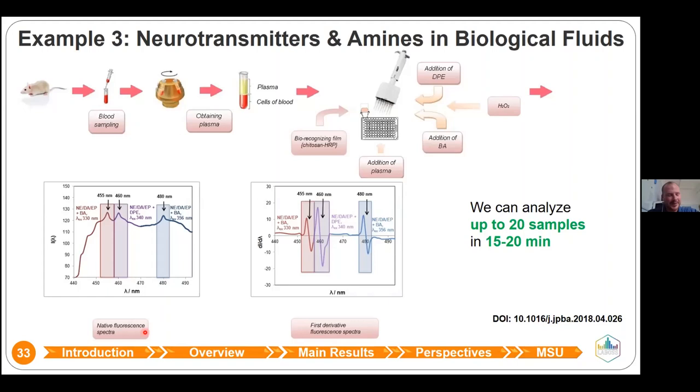Wait a second, I forgot how it's said in English. Oh my god, I forgot. Sorry, guys. Anyway, these are bioamines, so you will know them. Okay, I just need to place them on the slide.